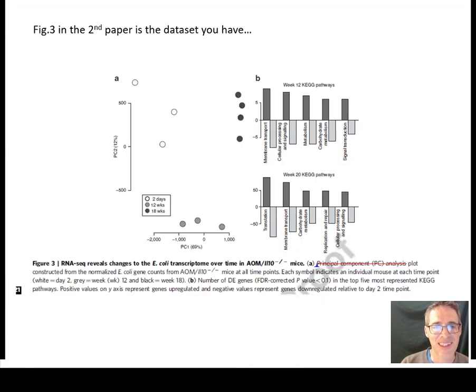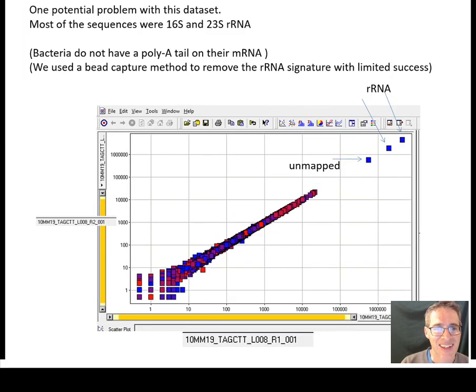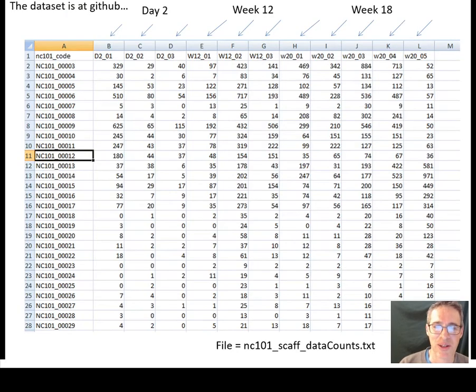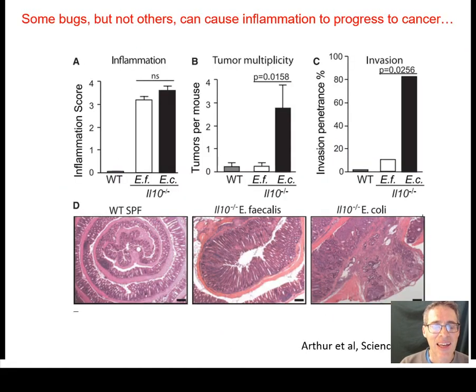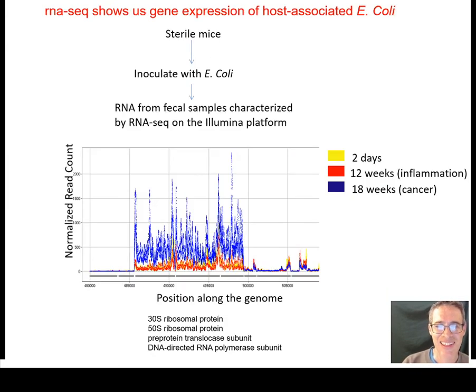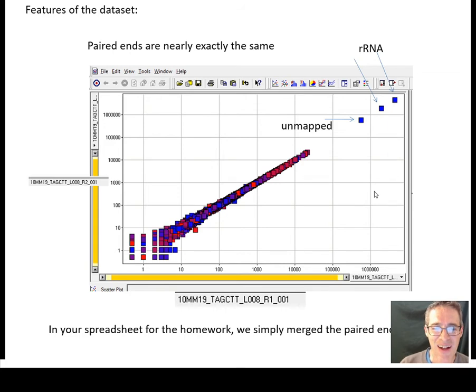So this is an interesting data set to look at. We're only really going to scratch the surface because we're not going to go into the biology, but I hope this motivates why this data set is biologically interesting. Now, I've made a number of adjustments. This count table is actually missing some information.